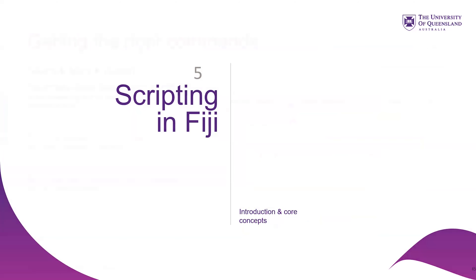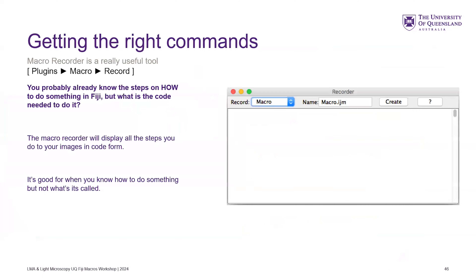We've got half an hour left. We don't want to just print how many slices you've had. You actually want to do ImageJ-type things. So how do you get the right commands? There's this lovely thing called the macro recorder. If you go to Plugins > Macro > Record, a window like this will pop up.